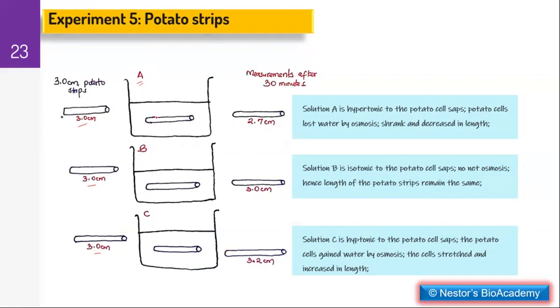For reliability of these investigations, you are always required to place more than one cylinder. You can place 3 cylinders in each case, and then later on you obtain the lengths and obtain an average for the same.